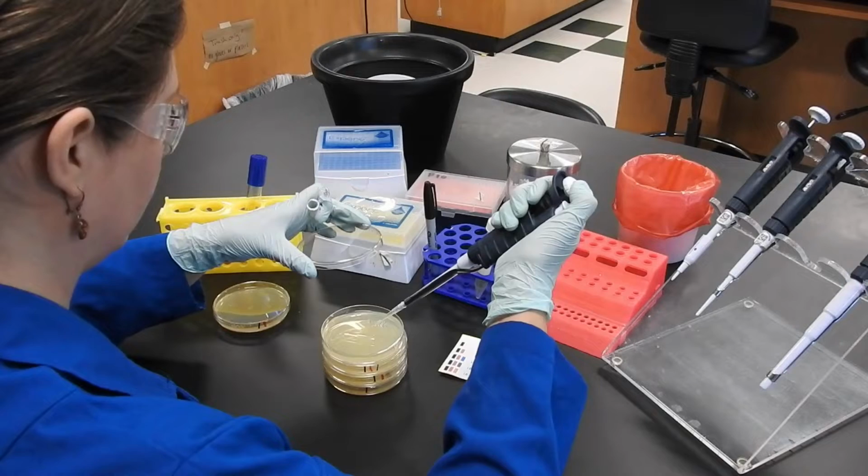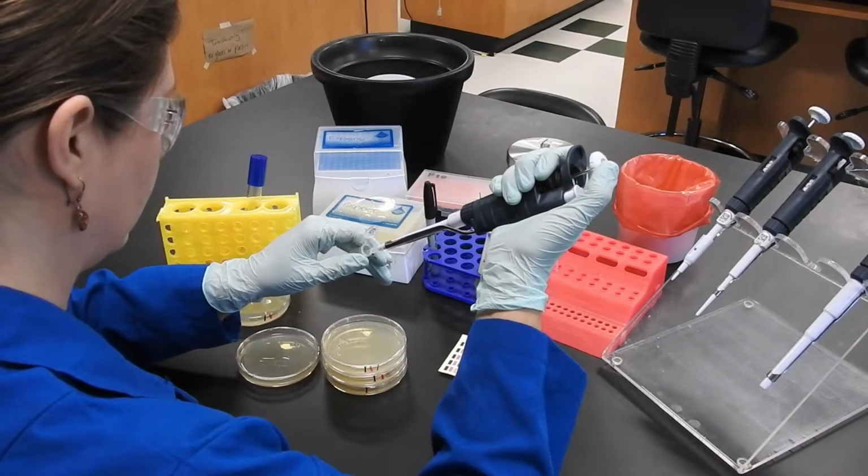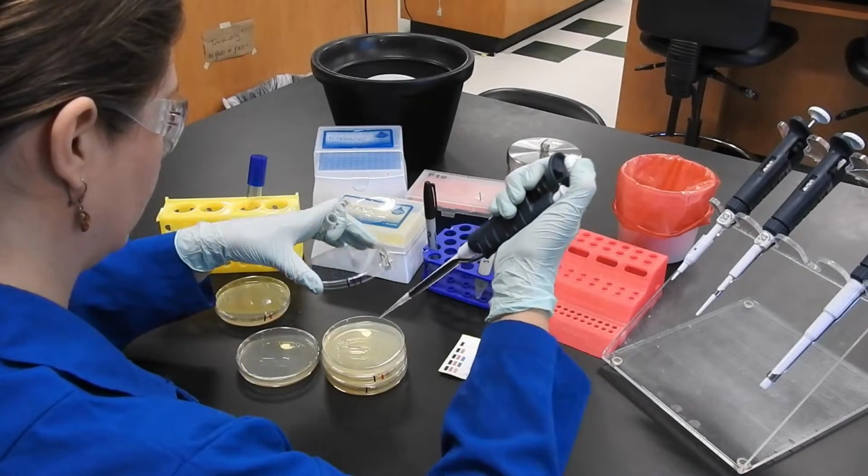Notice that the trash pail has a red liner. E. coli is considered a biohazard and is treated as hazardous waste. The red bag will be sterilized before disposal.